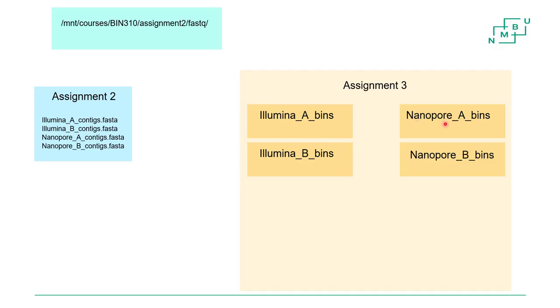with some variations, right? Because here you need to use Bowtie, these are Illumina data, right? These contigs are based on Illumina data. And then you must go up here to see where are the reads from sample A, right? For your data set. Take those reads, map to the contigs in here using Bowtie. This is module 8 stuff.